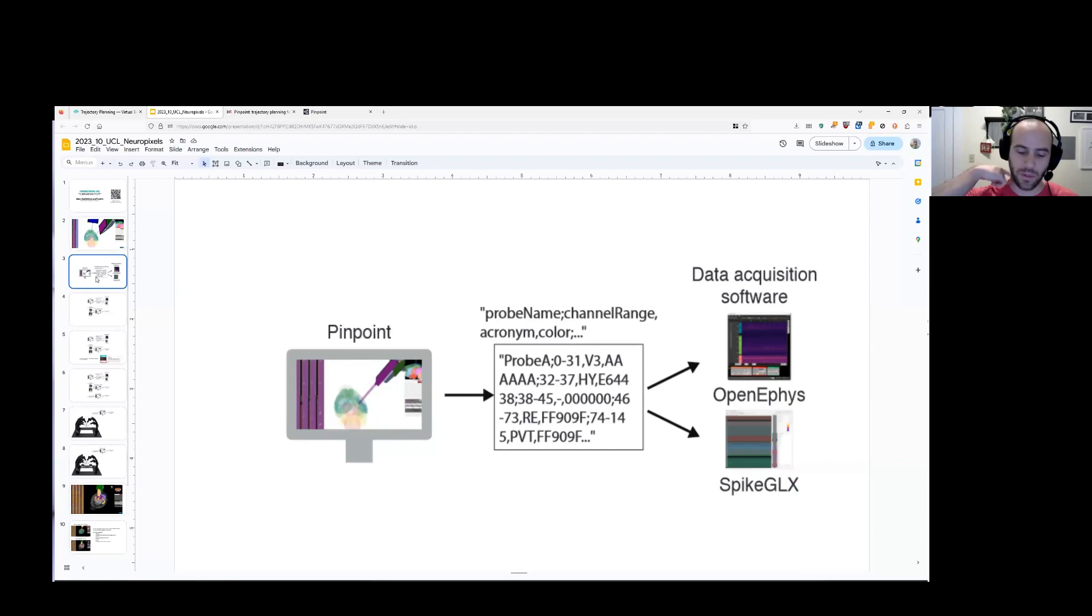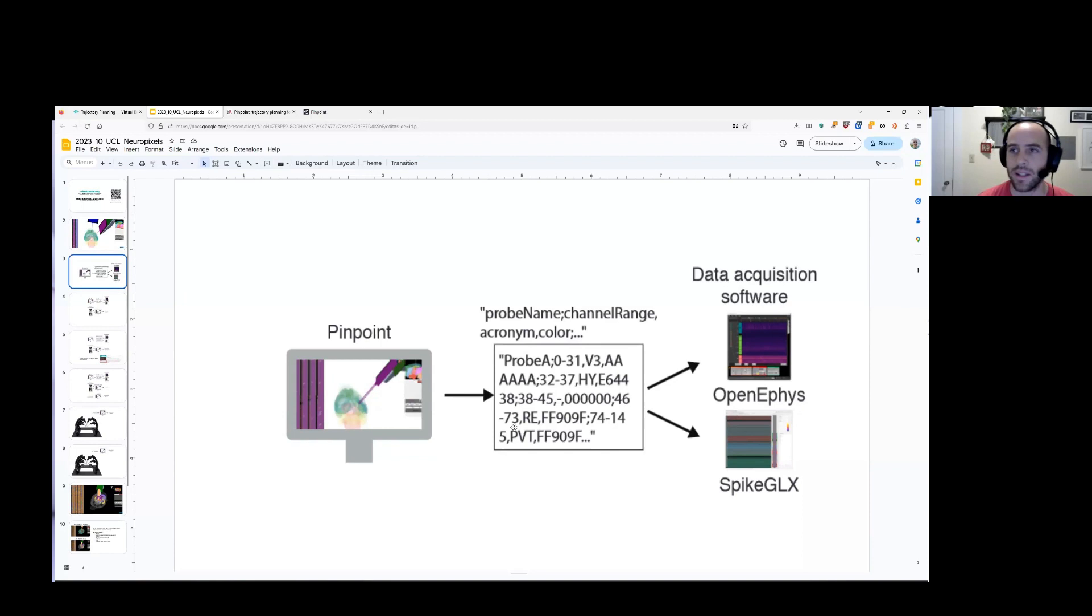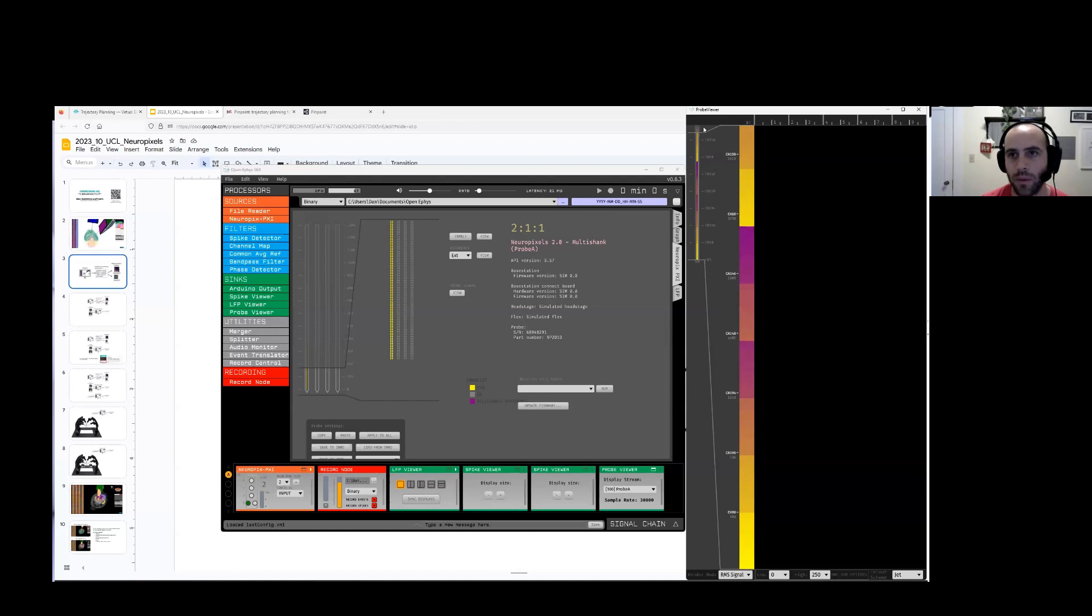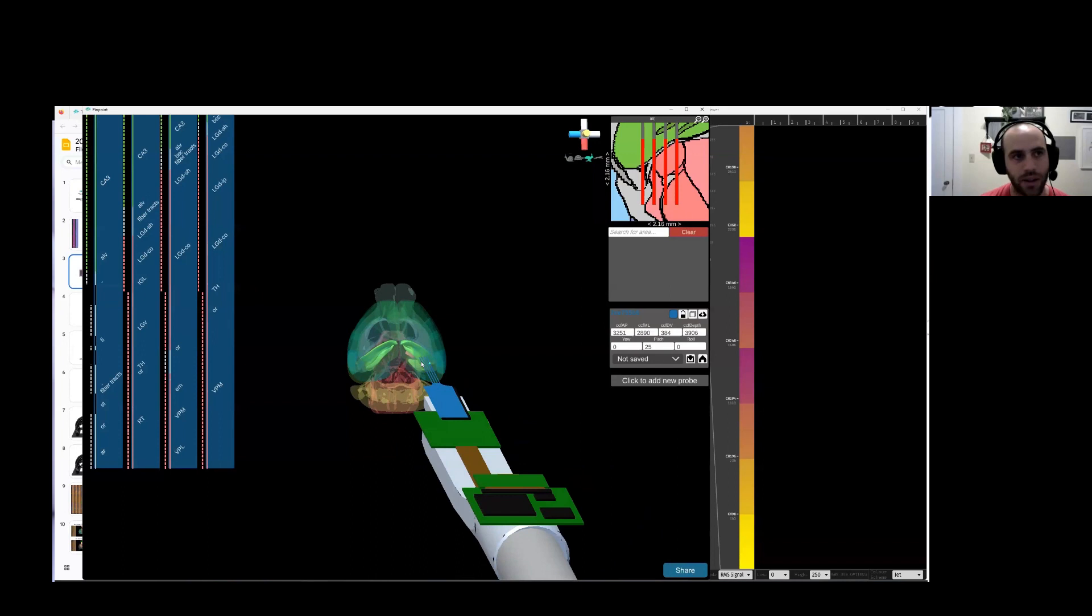So the other thing that we have built into Pinpoint now is the same thing that you saw for NTE earlier. You can link Pinpoint to data acquisition software. We basically pass forward an API that tells the data acquisition software where the probe is in 3D space. So I'm going to show you that really quickly. I have here the OpenEFIS GUI open. This is a four-shank probe that's set up in the scene. And I've attached this probe viewer object here. And I have Pinpoint running locally on my computer. This is the Windows build. And I have an insertion that's running through Hippocampus and down into Thalamus.